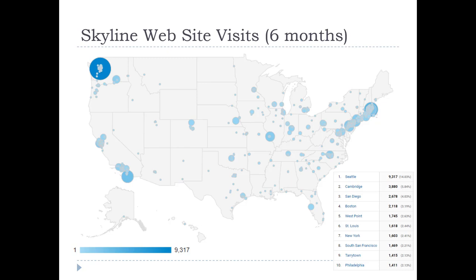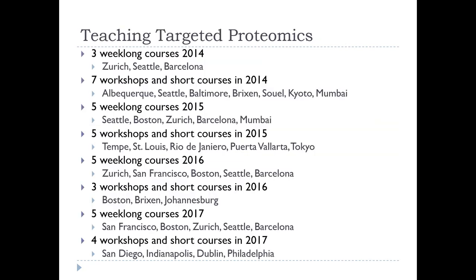But yeah, it's used all over the place, and if you learn Skyline, it's definitely a transferable skill for a mass spectrometrist interested in proteomics and now small molecule research. I've heard of people going to a new lab and emailing me to say, "Oh, I'm teaching my lab to use Skyline," and everybody's really excited. Someone got a job at SCIEX, and their whole presentation was how they'd used Skyline to do some analyses. That was a while ago.